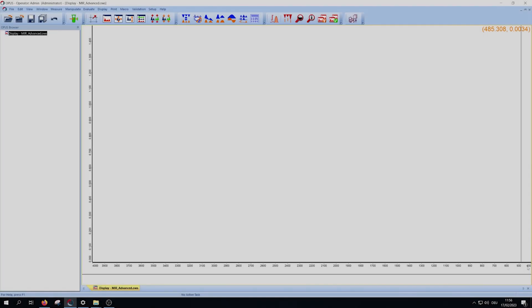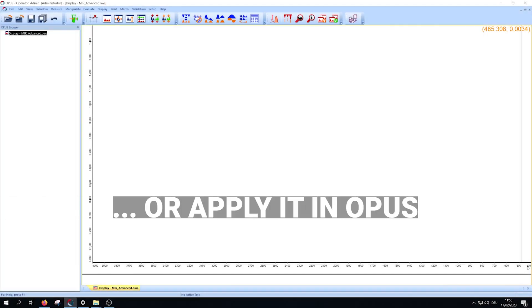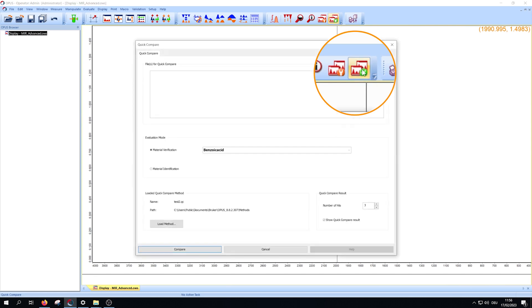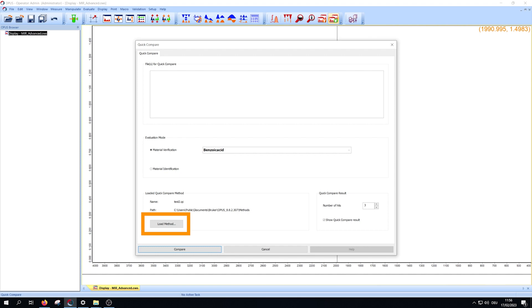First, start the quick compare workflow in Opus by clicking this icon. In the lower left part of the window, you can load a method if you want to change.